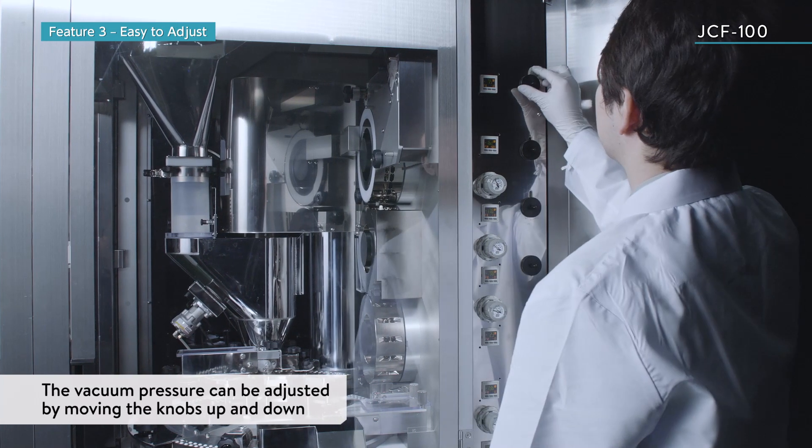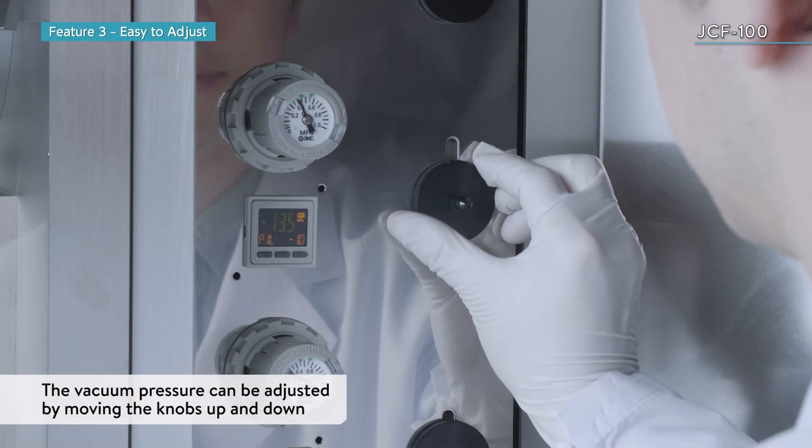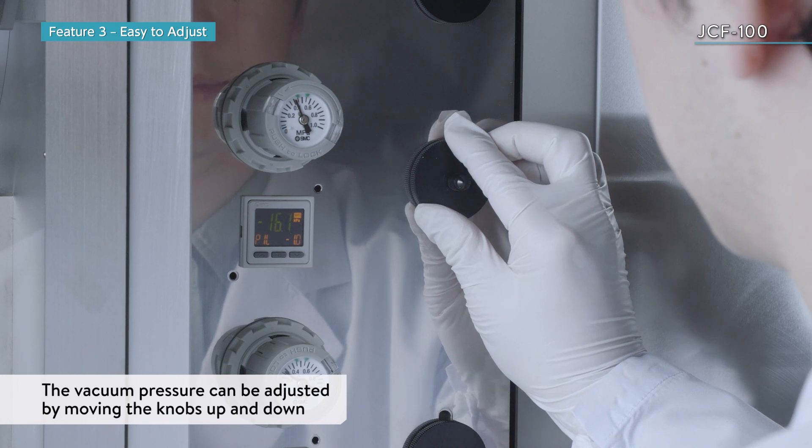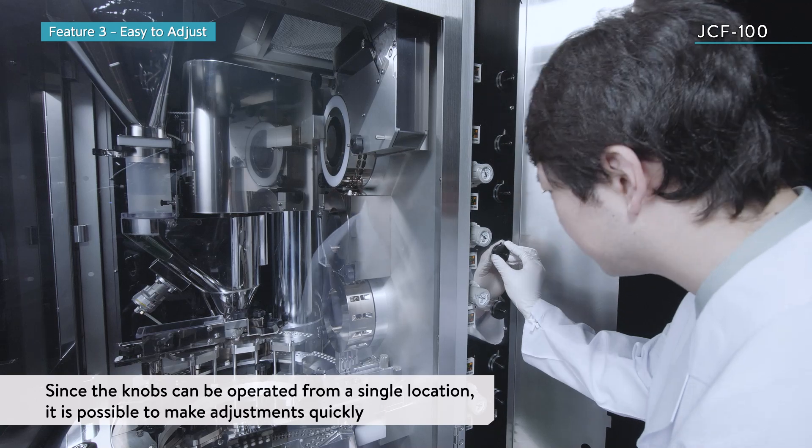In addition, the vacuum pressure can be adjusted by moving the knobs up and down. Since these knobs can be operated from a single location, it is possible to make adjustments quickly.